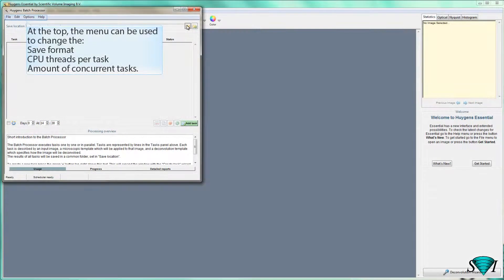At the top, the menu can be used to change the save format, the CPU threads per task, and the amount of concurrent tasks.